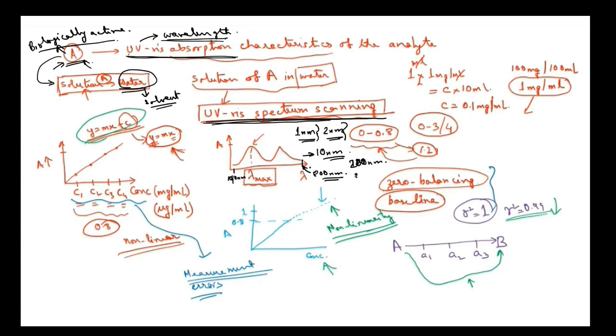Then after 200, it would go for 210 nanometer and so on up to 800 nanometer. But what happens to the wavelength radiations within 200 and 210? This is completely missed, right? Your scanning will be faster, but this will be missed.